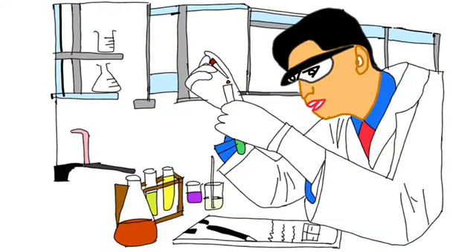At his laboratory, Dr. Steven conducted a series of experiments. But one question still remains. How is Dr. Steven going to determine various isotopes of heavy metals that contaminated Kim River and their respective percentage of abundance? The answer to this question is an analytical technique known as mass spectrometry.